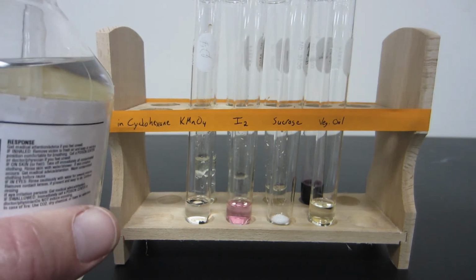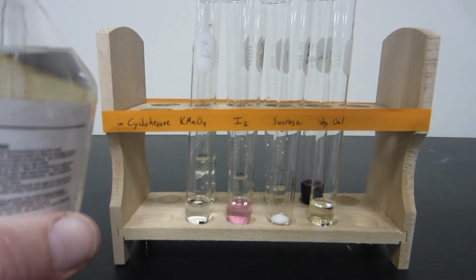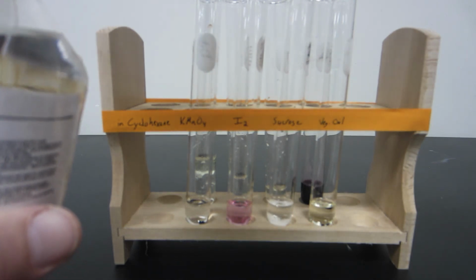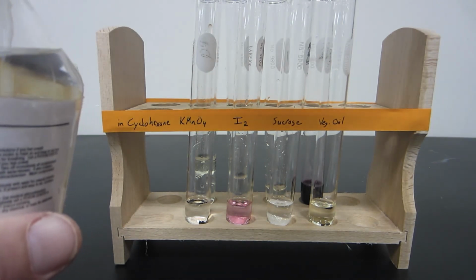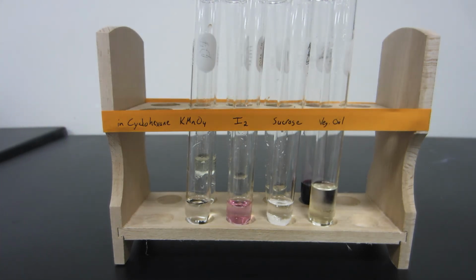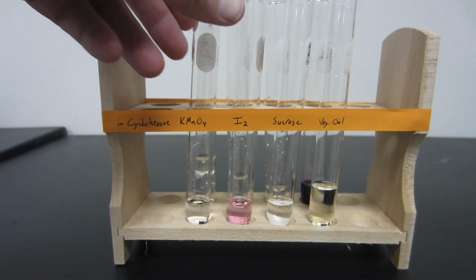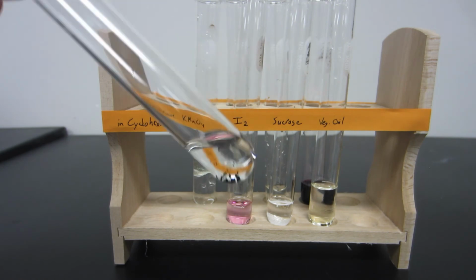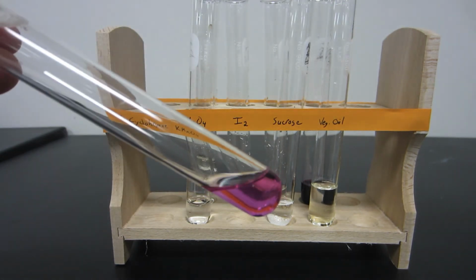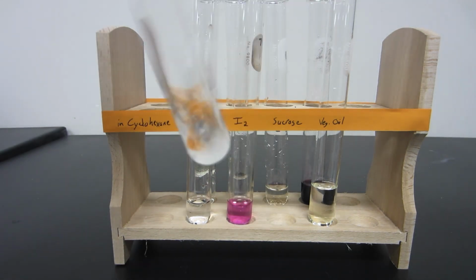Notice that the iodine did turn a purple color. That's telling us it is dissolving in the cyclohexane just a little bit. So that shows us that iodine is a nonpolar solute. Let's see if we can get a better picture of some of these. Okay, so potassium permanganate is not dissolving. We can see the iodine is dissolving. Remember, iodine is a purple solid. You can see it there.